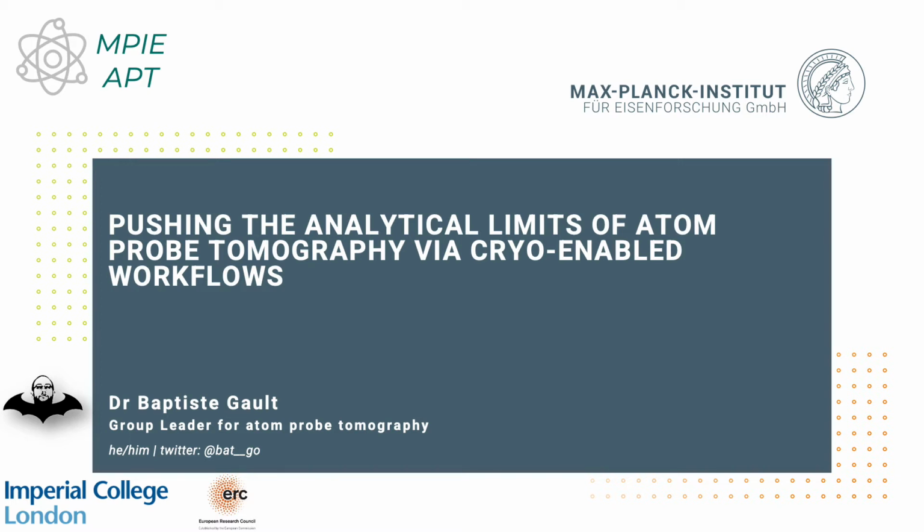Hi, it's a pleasure for me to give this talk as part of MMC 21, and I'm going to talk to you about how we've been developing a cryo atom probe and specific workflows to push the analytical limits of atom probe tomography.